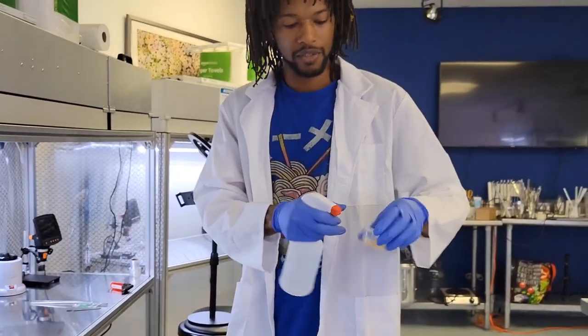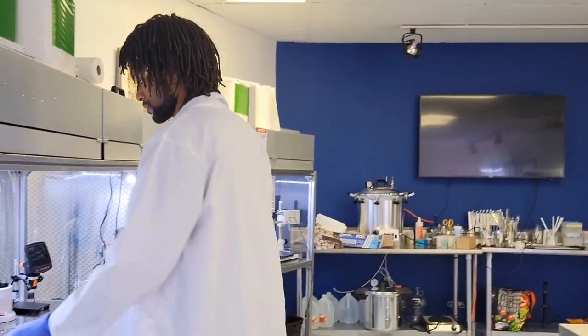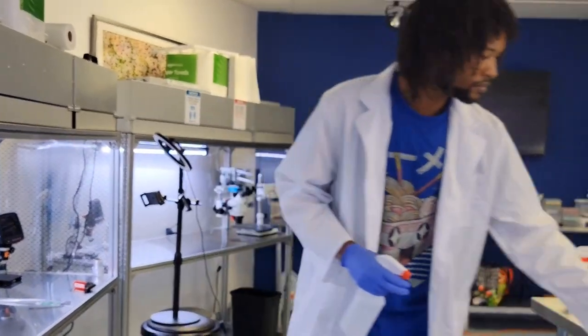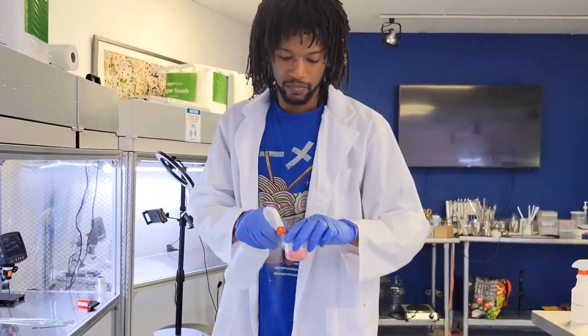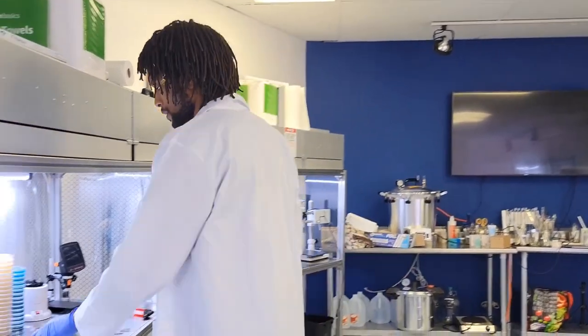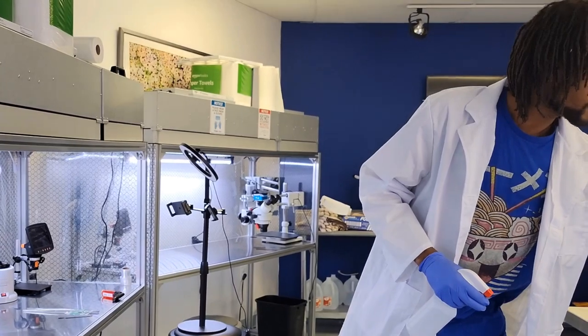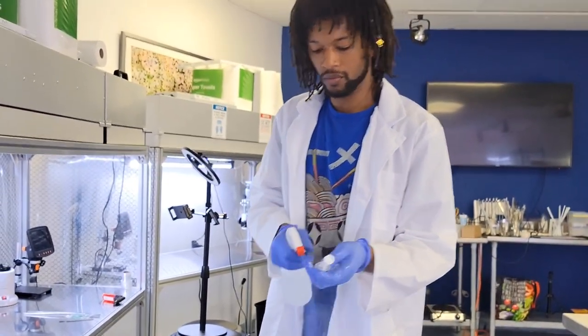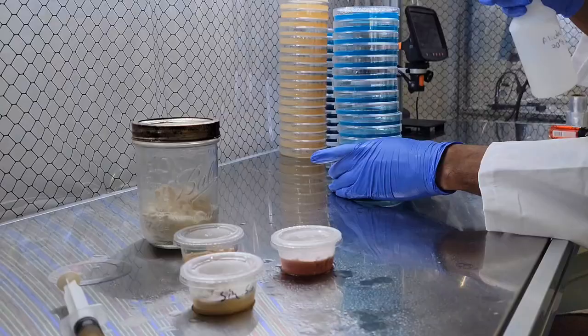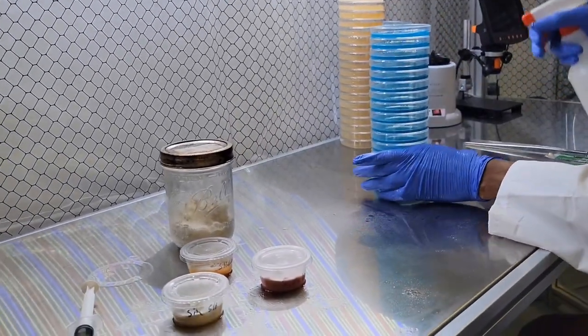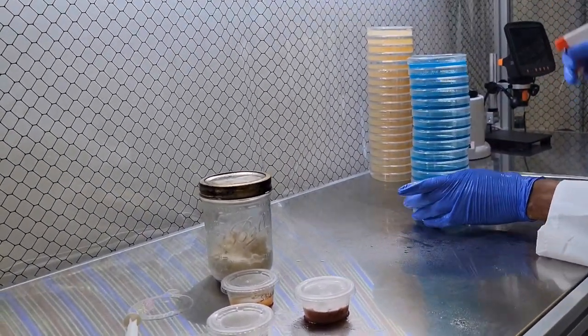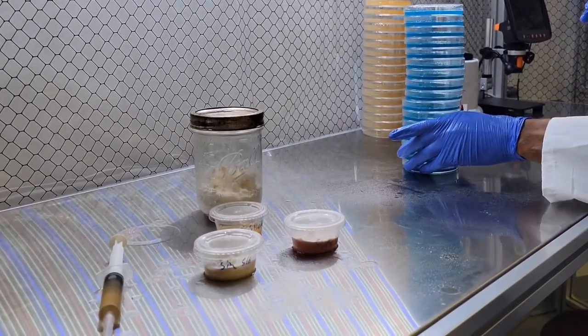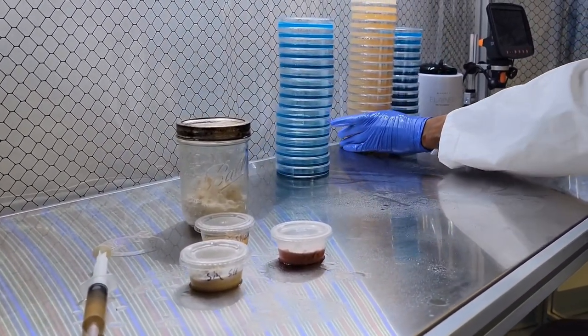This is the senens black reishi. This is what I call the sidewalk reishi, the one I found growing out of a crack on the sidewalk. This is lion's mane on liquid culture. Just a light spray. These have been sitting inside of the flowhood since I made them in the last video.